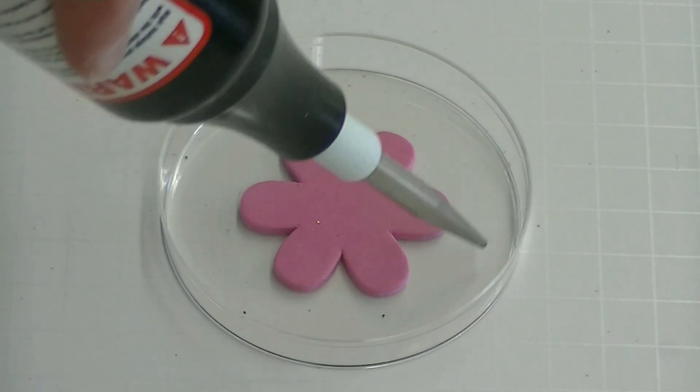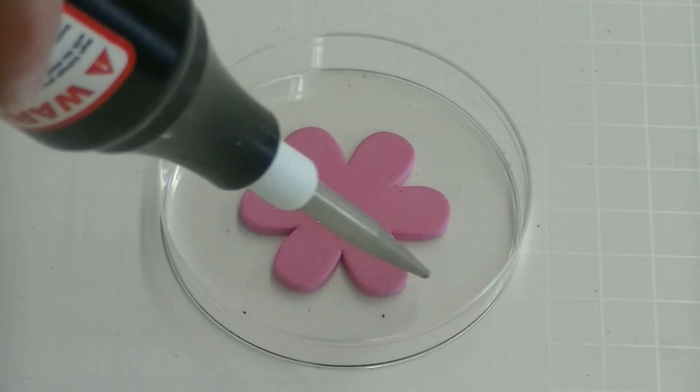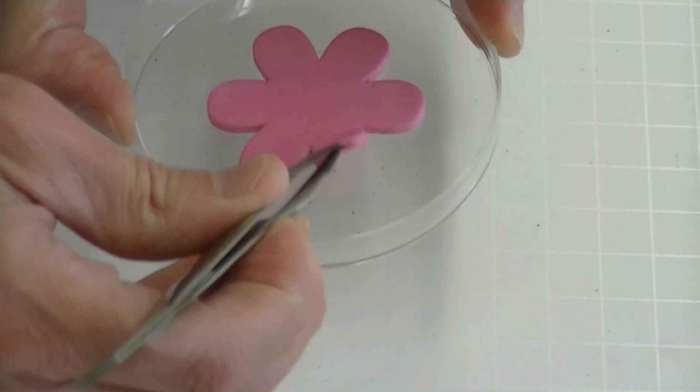The part of the dish exposed to the discharge is chemically modified. The portion of the dish covered by the sticker is not.